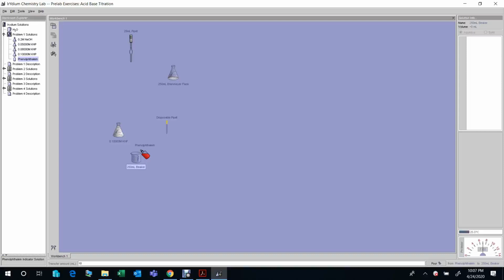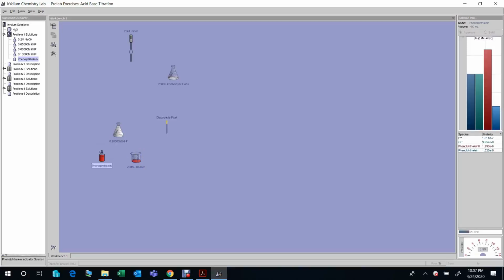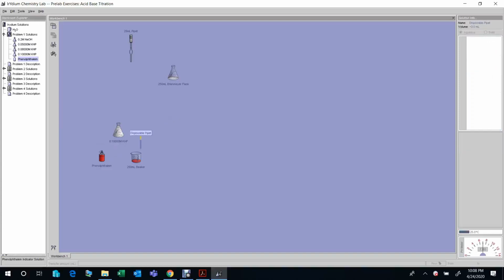We cannot put 10.00 something, right? It's not accurate. We cannot pour that accurately because when we pour, we use our hand. So we pour 10 milliliter, and then we can withdraw some.